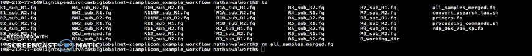For this particular sequencing run, we conducted 2x300 paired end Illumina sequencing over the V4 region of the 16S rRNA. And the V4 region is roughly 300 base pairs. So given that we ran 2x300 paired end sequencing over a 300 base pair region, we have virtually full overlap. And please see figure 1 below for a visual of what that looks like. Now the benefit of full overlap as compared to sequencing another longer region of DNA that has less overlap is that we have improved base calling accuracy with full overlap.